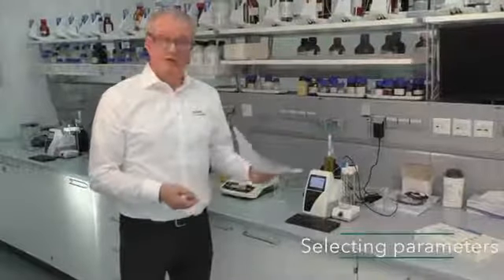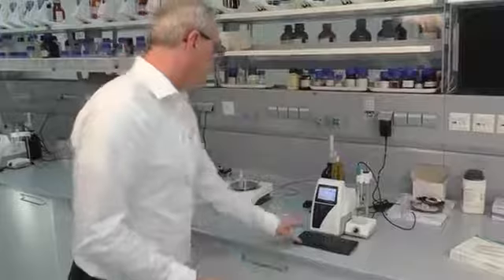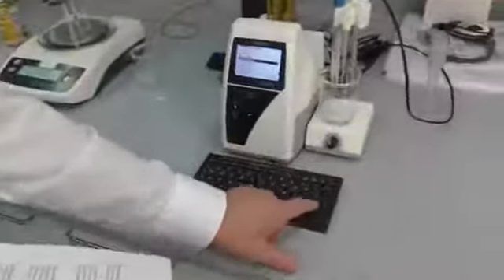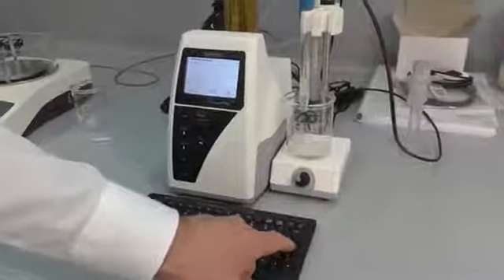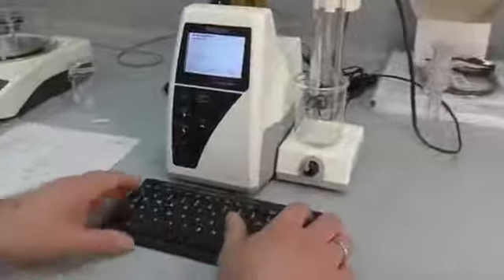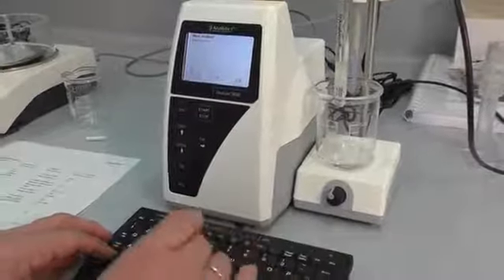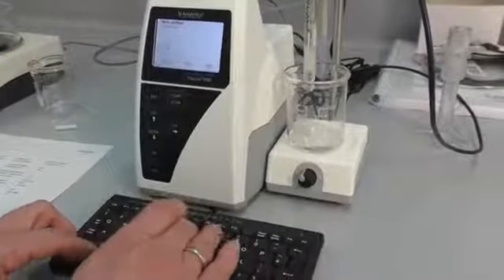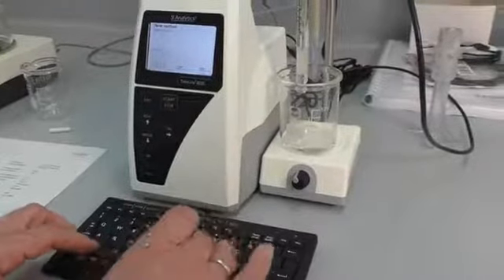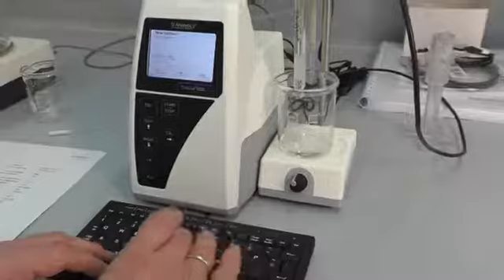We have application notes, so we can use the parameters from the application note. We'll use the default method again for total acidity, and to make it easier we will change the name and say it's acidity in mayo, to make it simple.